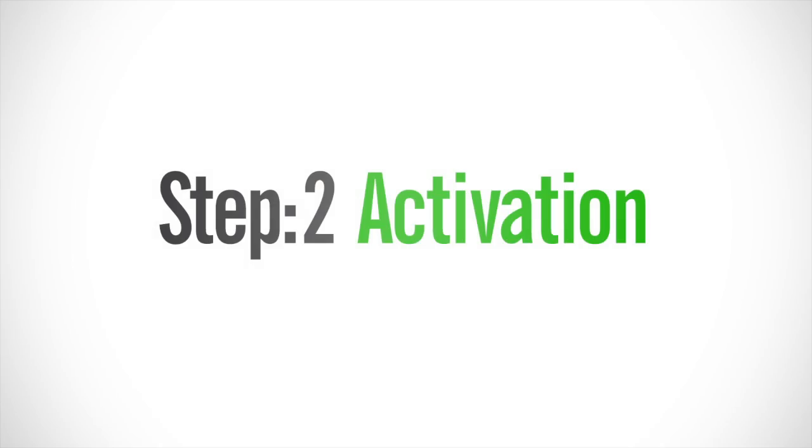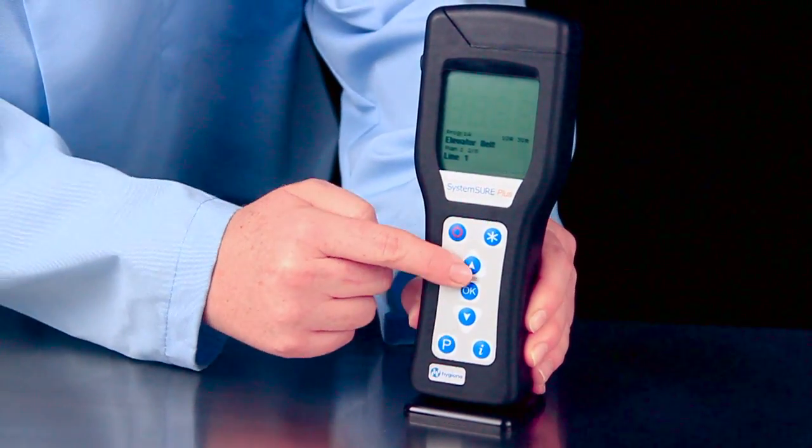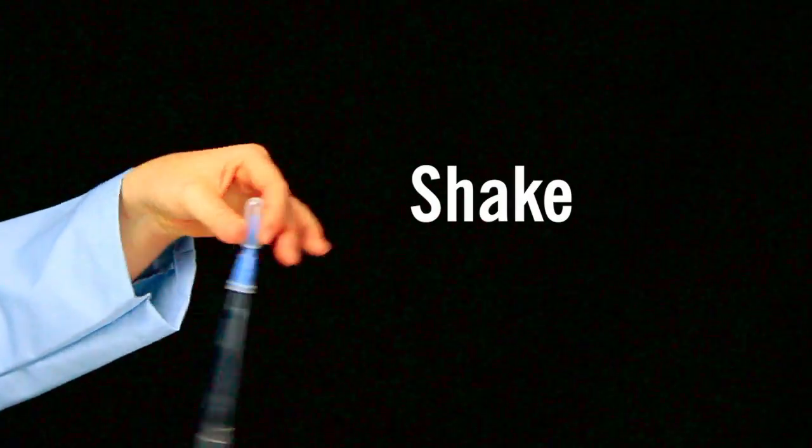Replace the dipper in the tube. The second step is activation. If you've programmed locations in the luminometer, select the location to be tested. The easiest way to activate Aquasnap is to hold the device in your fist and use the thumb and forefinger to break the snap valve by bending the bulb forward and backward. Next, squeeze the bulb twice to expel liquid into the tube. Then shake for five seconds.